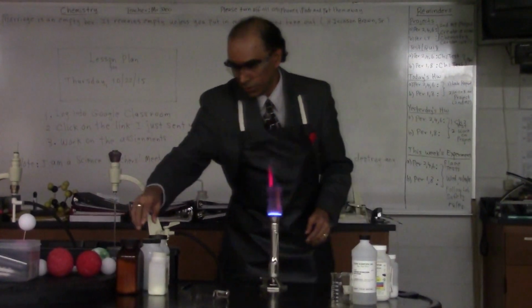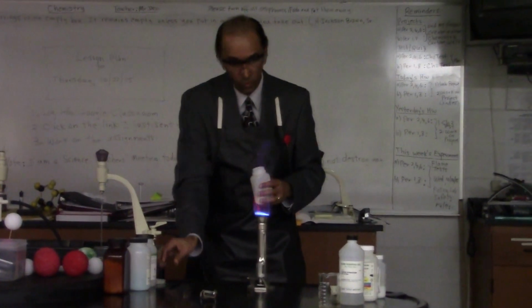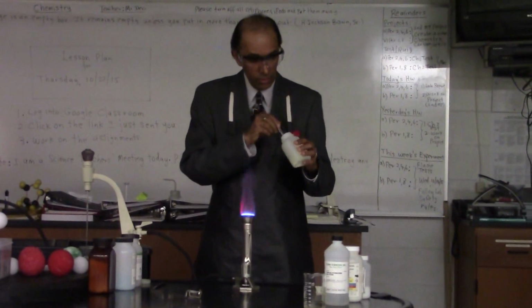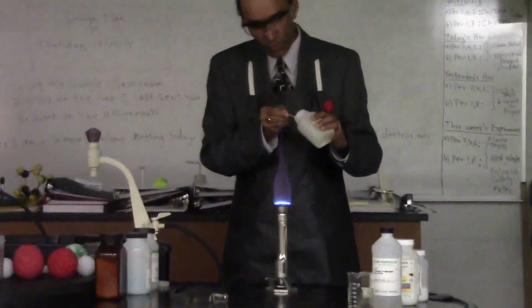Let's go to the fourth, and the fourth is strontium chloride. When I do strontium chloride, I want you to think of all the flares that the police officers use on the road. Okay? And what's the color of the flares?